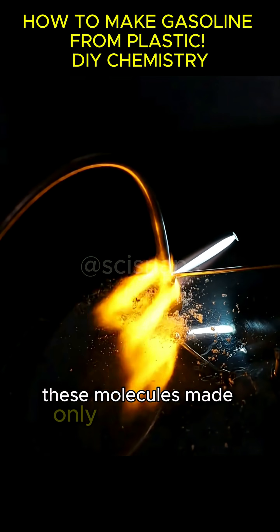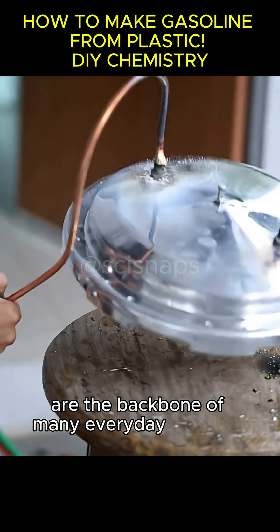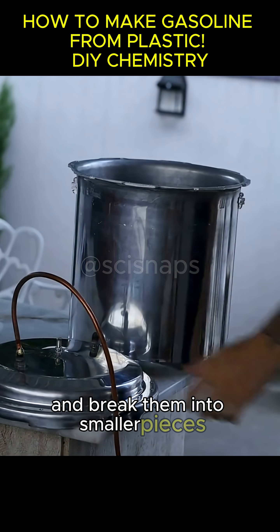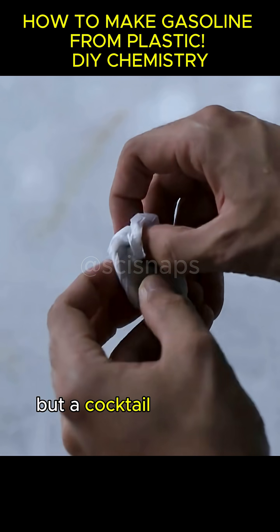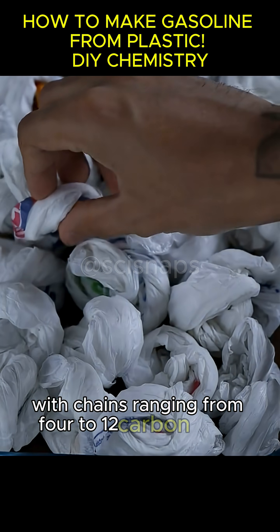These molecules, made only of carbon and hydrogen, are the backbone of many everyday products. We're going to take these monstrous plastic macromolecules and break them into smaller pieces. This process is called cracking. The gasoline we want isn't a single substance, but a cocktail of smaller hydrocarbons, with chains ranging from 4 to 12 carbon atoms.